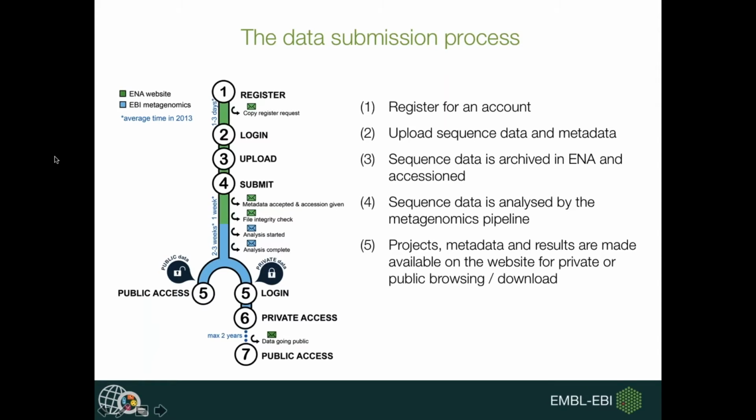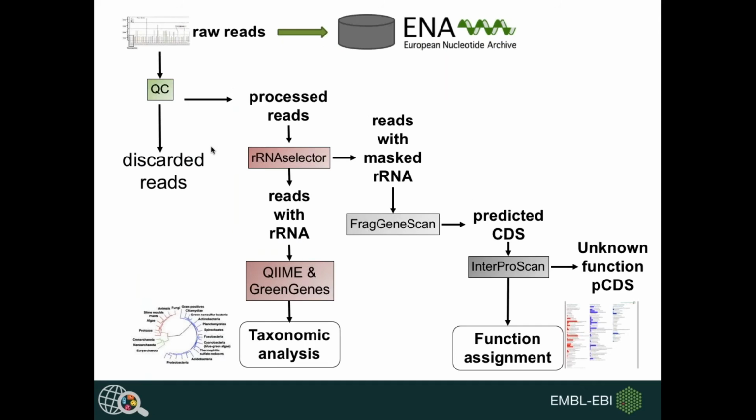This is quite an old slide, so it has some timescales on the left-hand side which are a bit out of date now. But depending on the amount of data we get, we try and turn things around within a week, a week maximum-ish. But if we get huge amounts of data, obviously that takes longer. So that's how you get your data to the site.